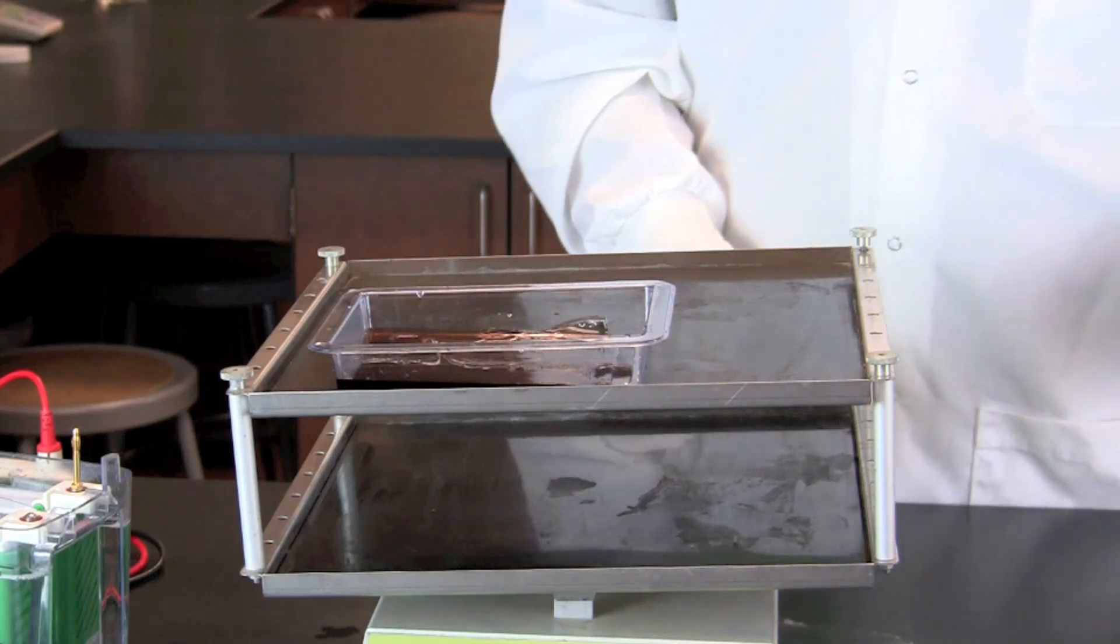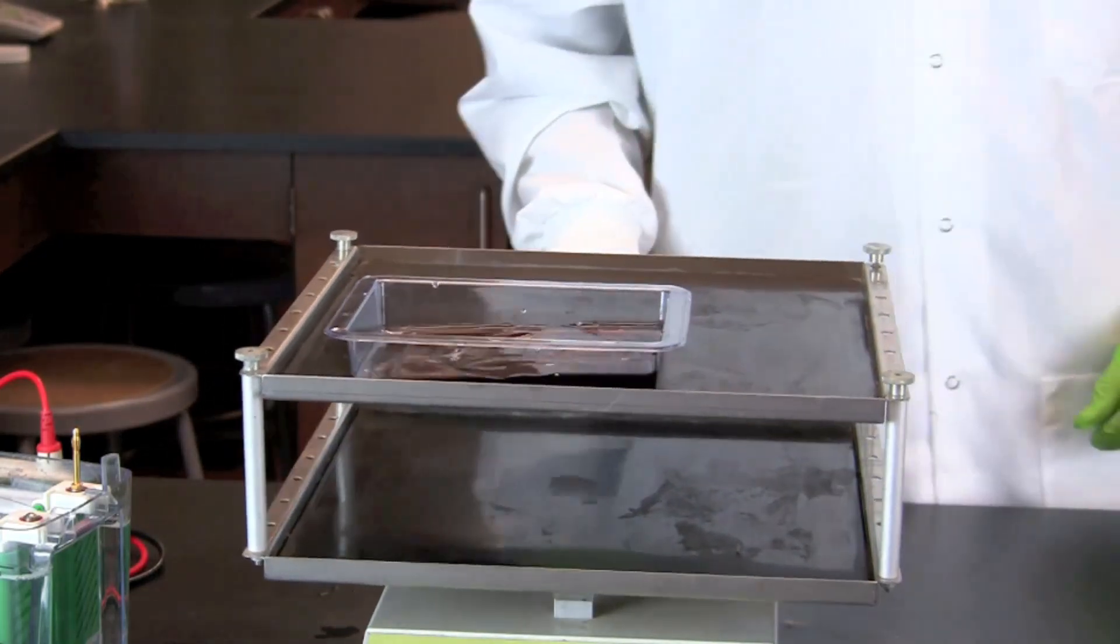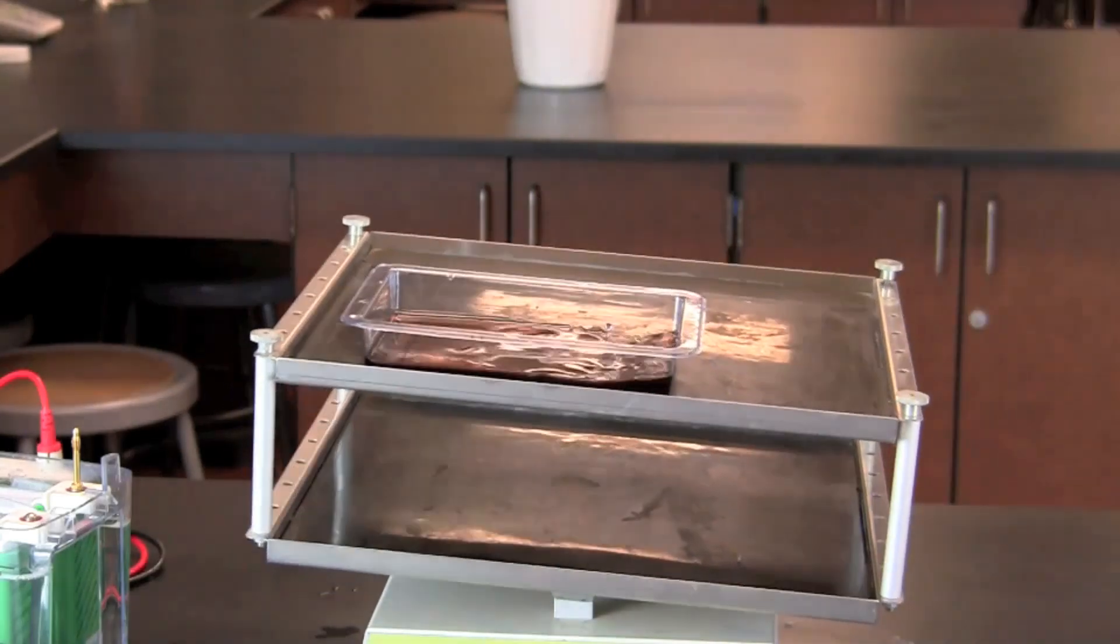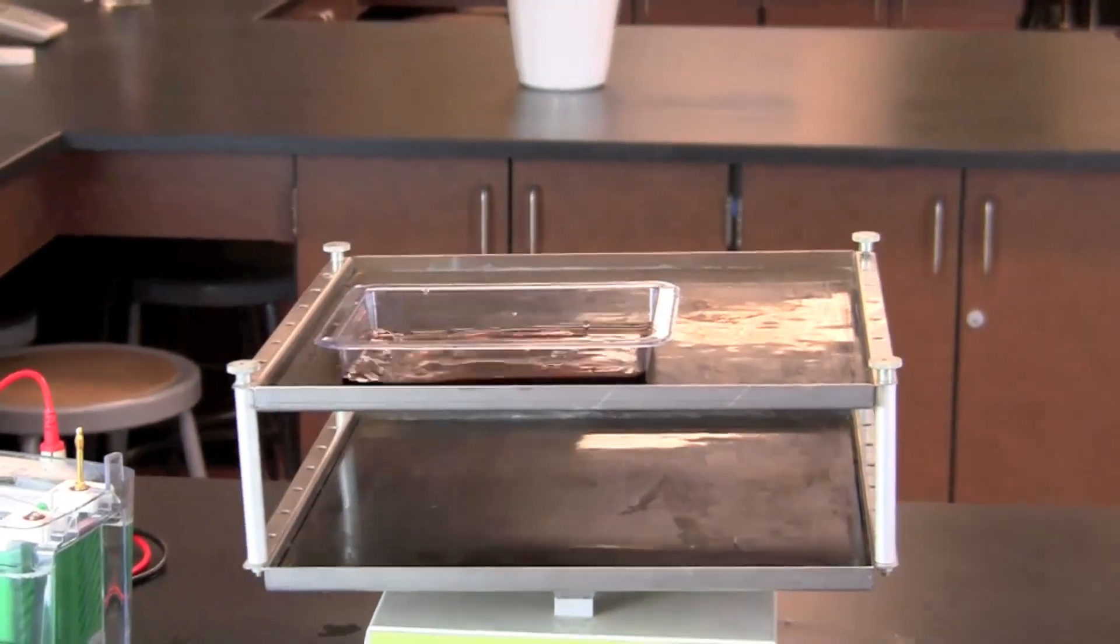After staining, rinse the gels two times in tap water. De-stain the gels in a large volume of water overnight, changing the water at least once. Blue stained bands will be visible on a clear gel after de-staining.